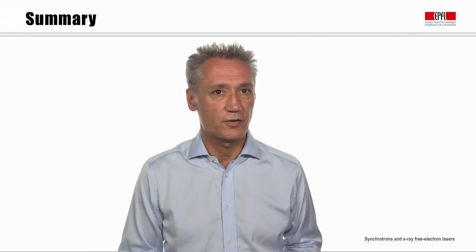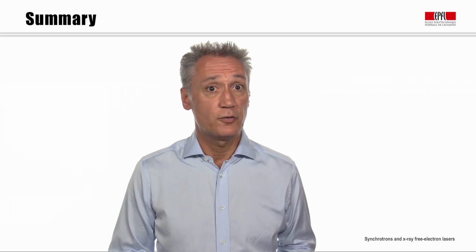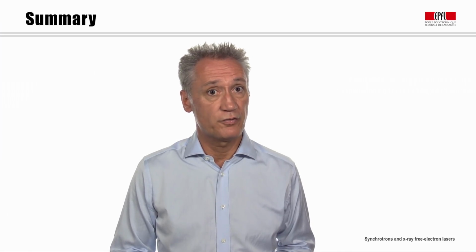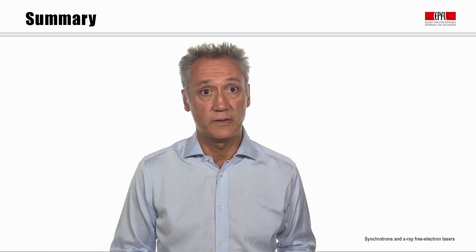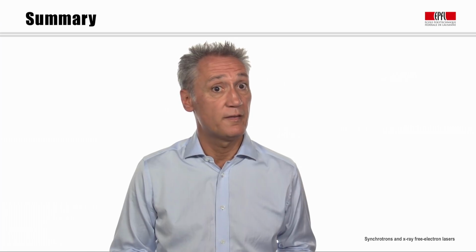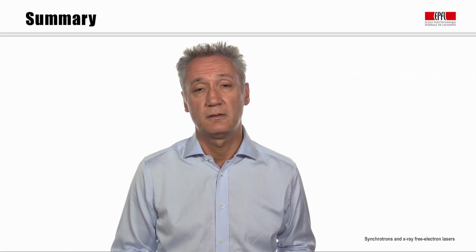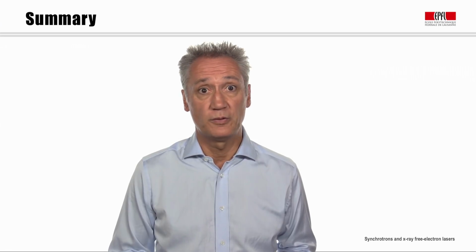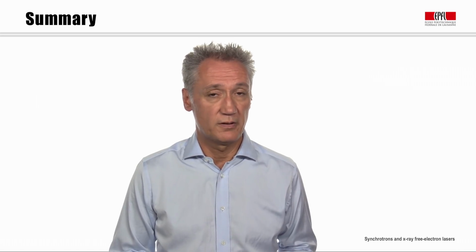Monochromators are the heart of X-ray optics. This video has been devoted to their description. We have now covered the generation of synchrotron light over the previous 2 weeks, and its filtering, focusing and monochromatization in the first 2 videos of this week. We complete this week's videos in the 3rd installment by discussing X-ray detectors.